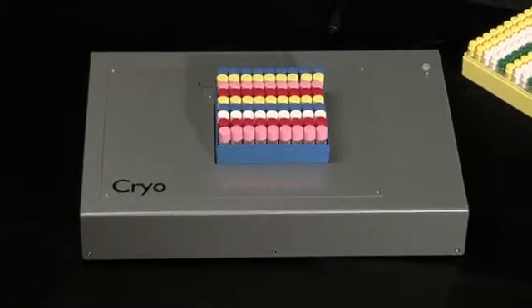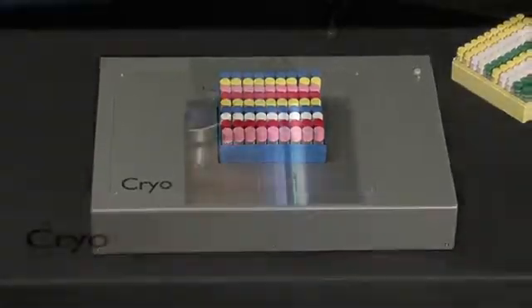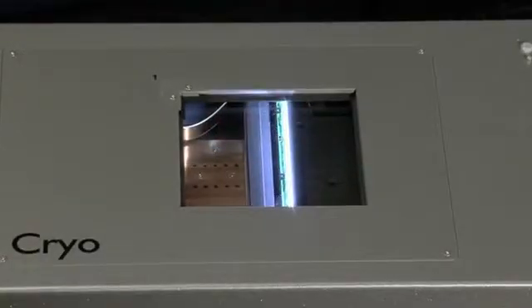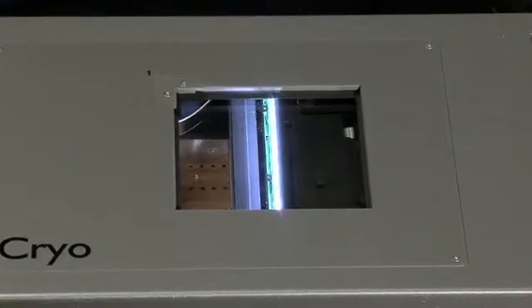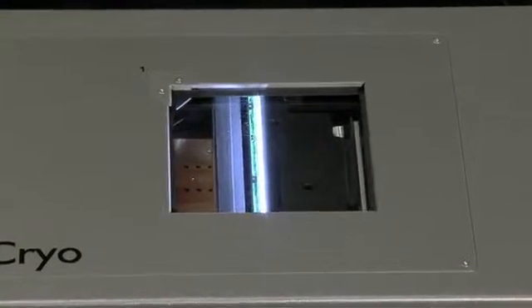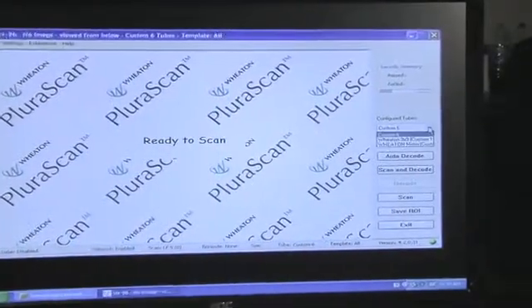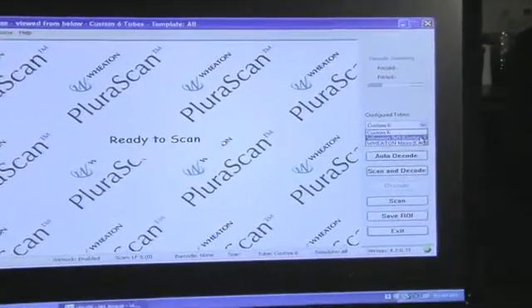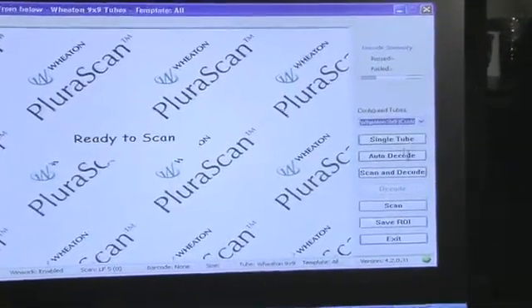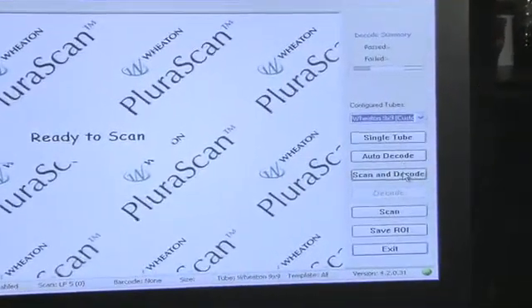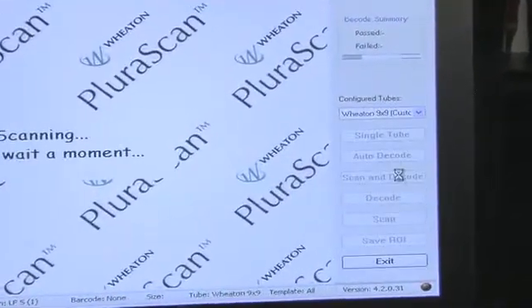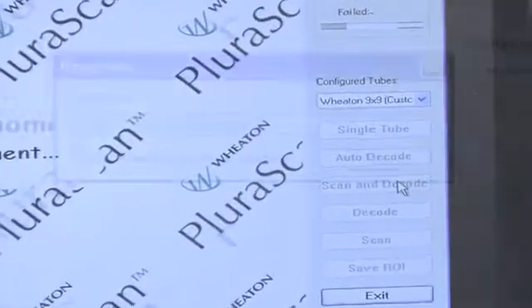The Wheaton PluraScan uses the same familiar steps you would to scan a photo at home. Using the drop-down menu, select your predefined rack format from the list that most closely matches your current rack.